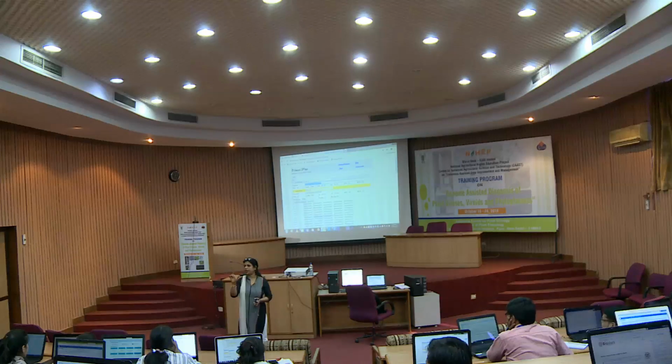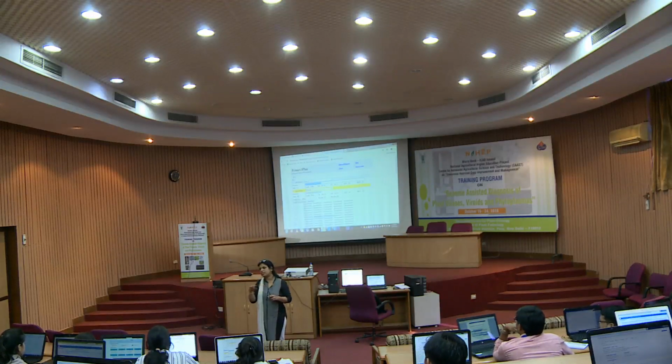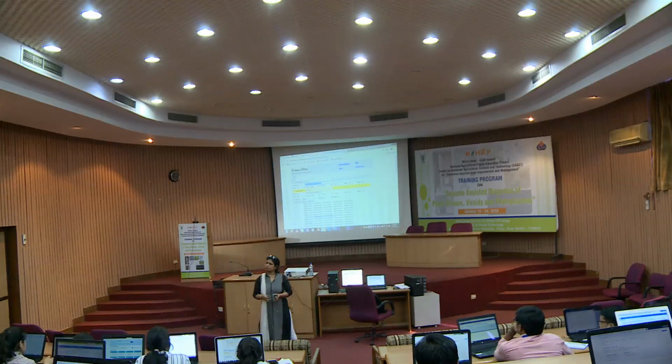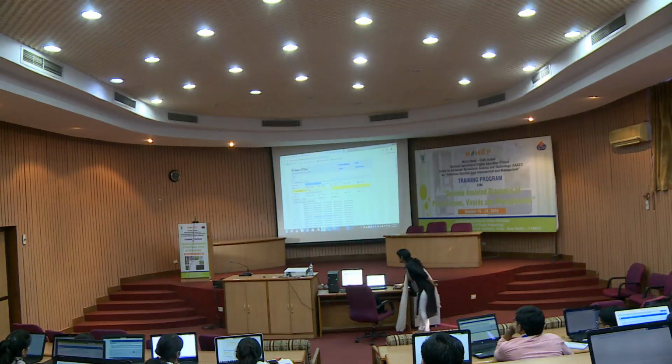The sequence, suppose around 1 kb or 1.5 kb, is already with you, and the forward and reverse primers are already designed to amplify that region. Now you can design an internal primer in any orientation, so that the company can use it to sequence that region. You can use this software for it, because here you put in the sequence and it highlights where it is designing the primer.